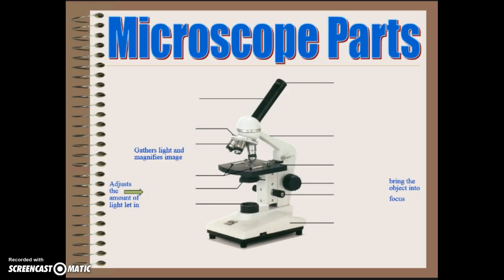First off, starting at the top of the microscope, we have what we call the eyepiece. This is the part of the microscope that you look into using your eye. It will magnify objects and focus light onto your eye. Most microscopes have a magnification of 10x.